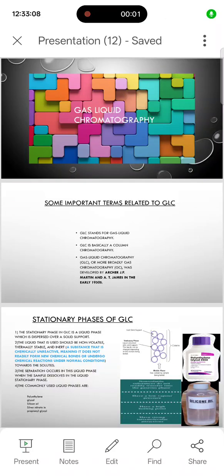Hello everyone. Today we are going to discuss gas liquid chromatography. There are two lectures on chromatography, so this is, I think, the third lecture, that is gas liquid chromatography. Okay, let's begin.